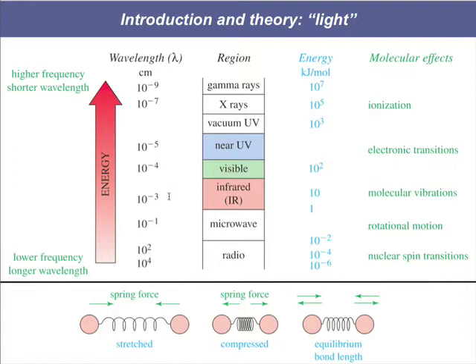If you recall from mass spec, we saw that electrons could cause molecules to ionize and then fragment. It turns out that electrons have the same wavelength as X-rays. For an electron, since it's a particle, we call it a de Broglie wavelength, but X-rays and electrons share the same wavelength and energy for a mole of photons or electrons, and they cause ionization.